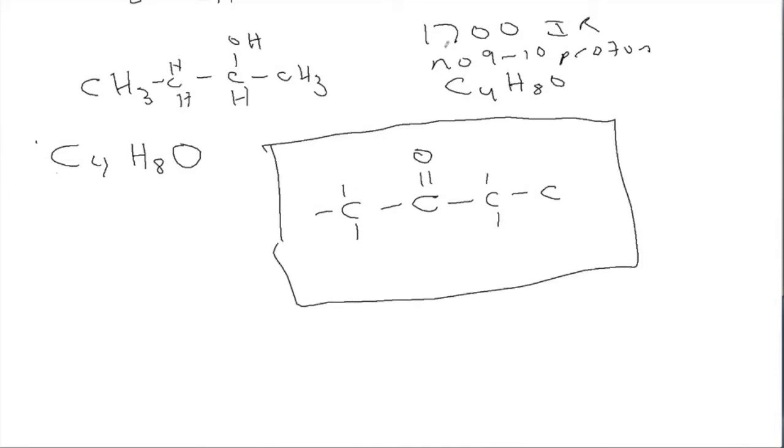That's right. 1700 tells us there's the carbonyl. We know it's not an aldehyde, so we can write these 2 carbons, and then there must be another carbon attached to them, and the only thing that can go in all the other places is hydrogens. Now, I'm not saying you have to ignore the other information. You can confirm this by checking against the proton. But you can see how much information you can squeeze out just from these 3 pieces of information.